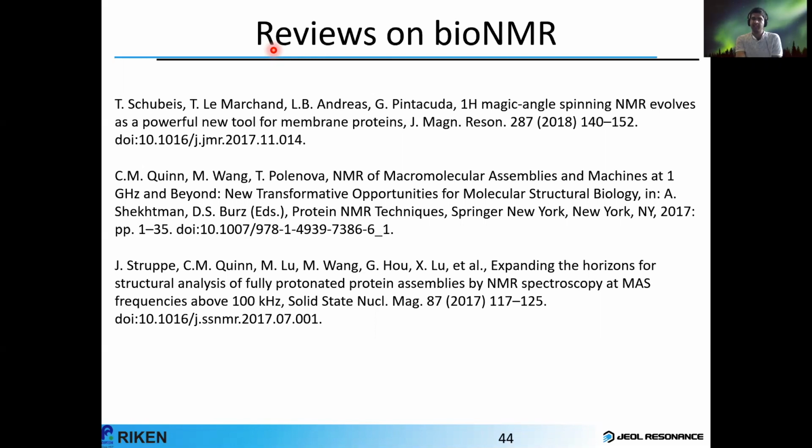All right. So the next question is from an anonymous attendee. Could you comment on the practical aspects of sample packing and reusability of rotors for 0.7 millimeter rotors specifically?